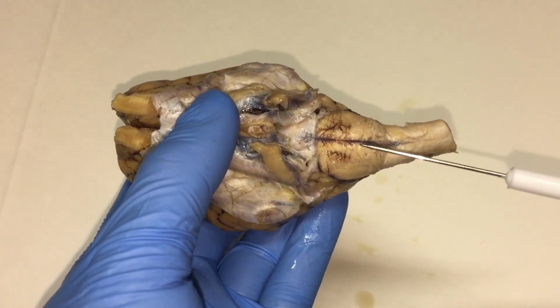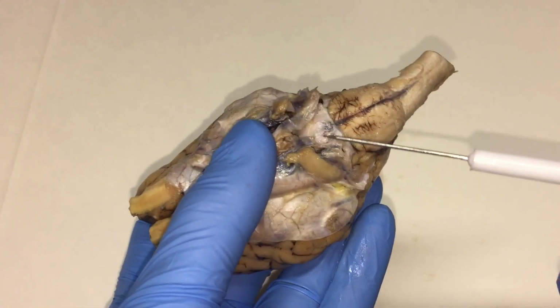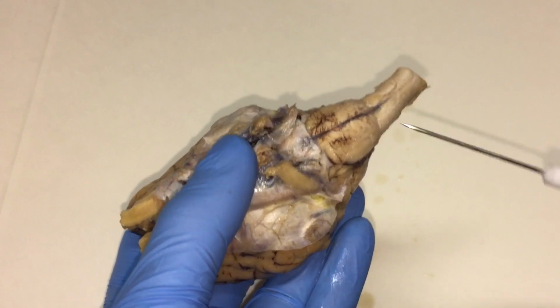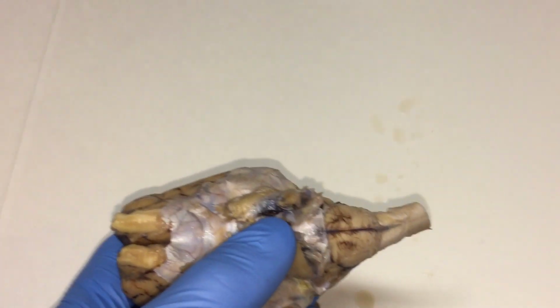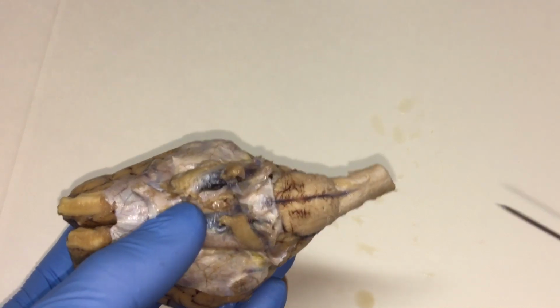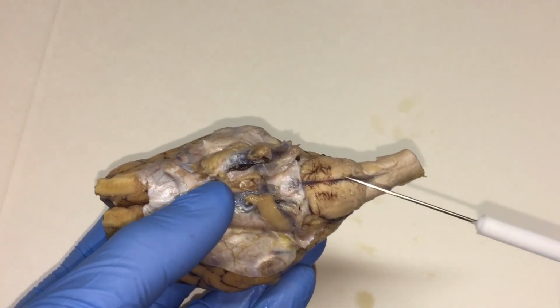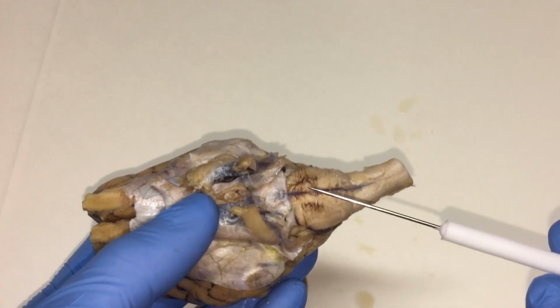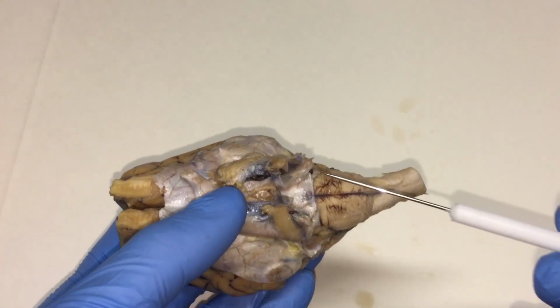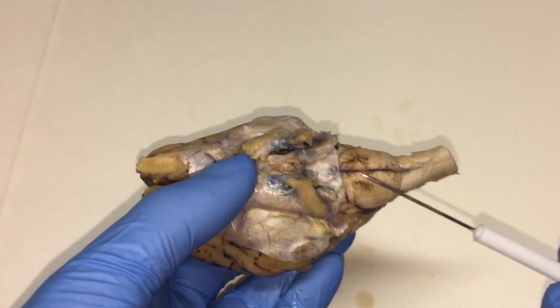So the medulla oblongata, along with another structure which is actually further up, should be over here, called the pons. So both of these structures, the pons and the medulla, have vital respiratory centers. So they have nuclei that work together to regulate the muscles of the ribs of the sheep, which are responsible for breathing. So they basically make sure that the sheep continues to breathe and it doesn't stop breathing.